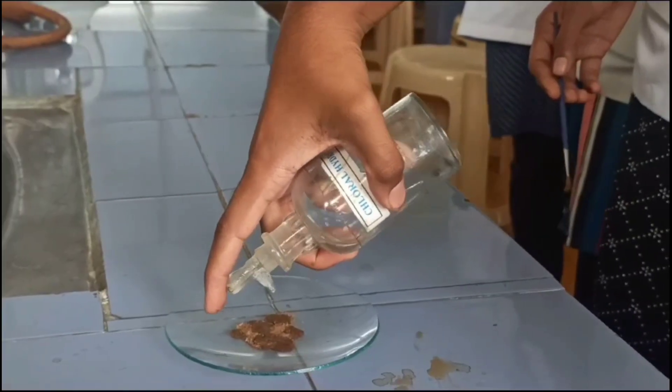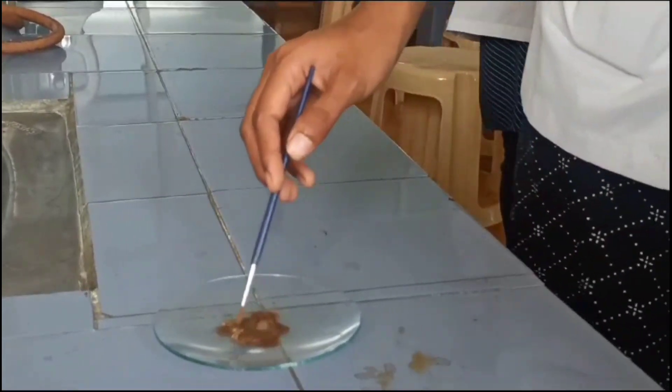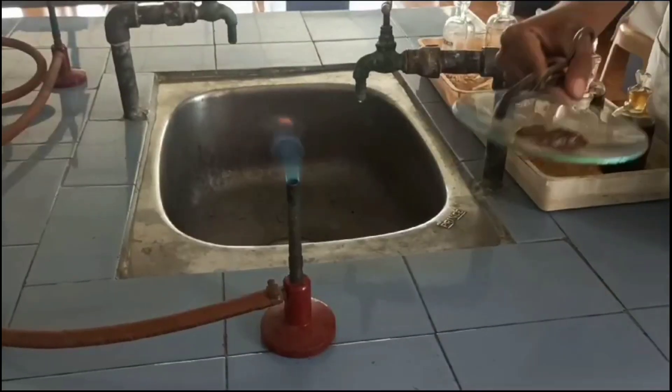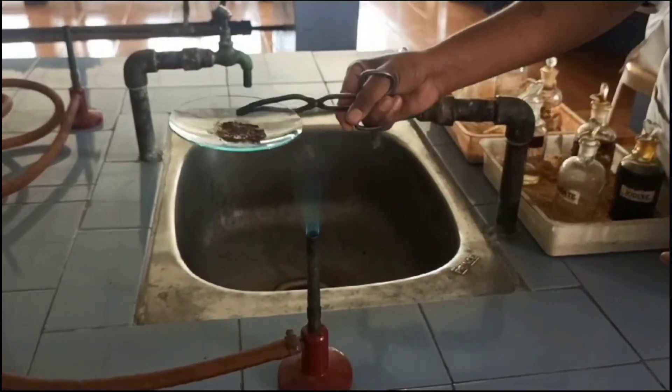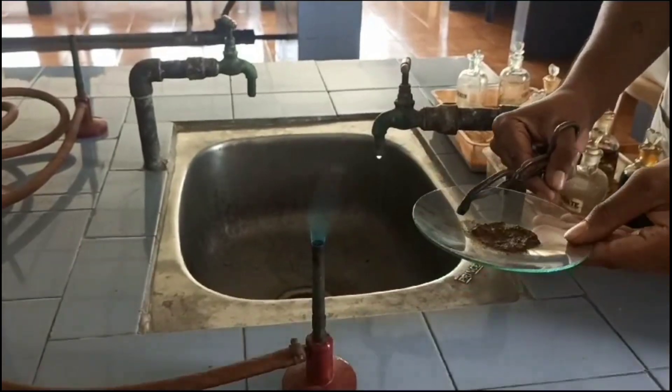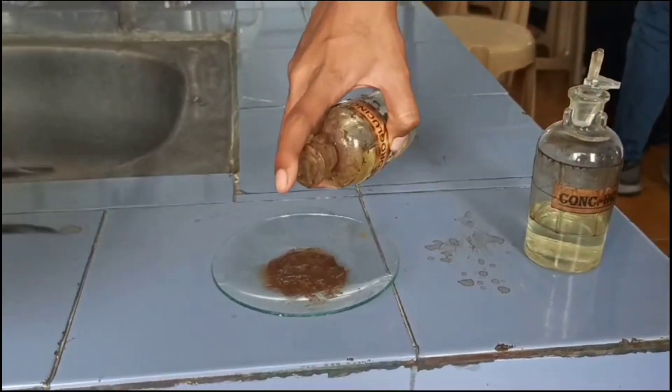Take a dry powder of Clove in a watch glass and add Chloral hydrate, which acts as a cleansing agent. Mix thoroughly with the help of the brush and heat gently, then allow it to cool. After cooling, add Phloroglucinol and Concentrated HCl in equal concentration.